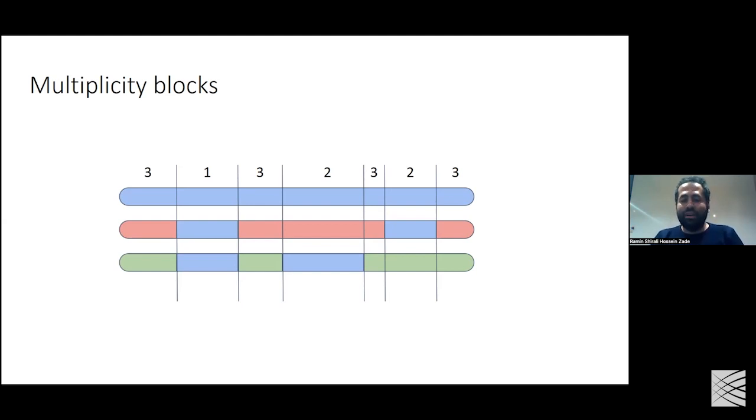It's a waste to try to reconstruct those regions. Actually, it's impossible to reconstruct the haplotypes of those regions, especially because they have the same sequence. And if these regions are large, it's impossible to connect the phased regions on the sides of them.